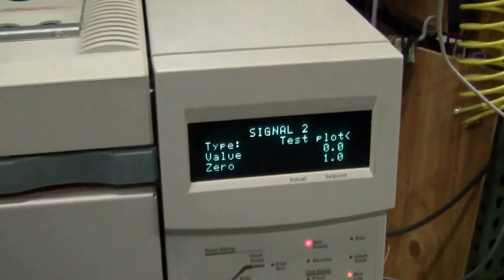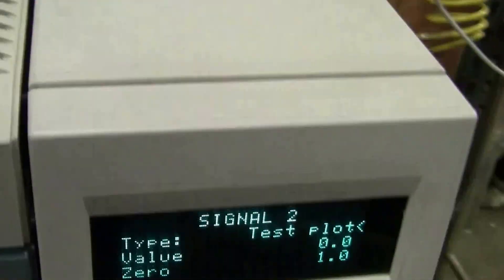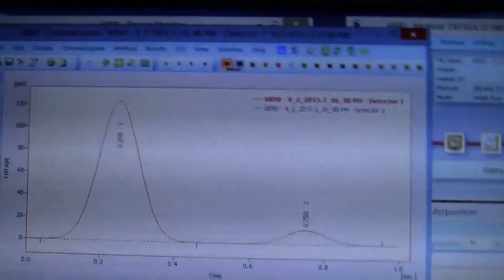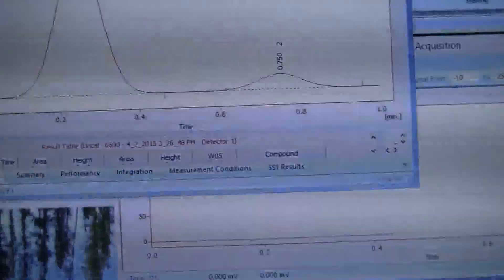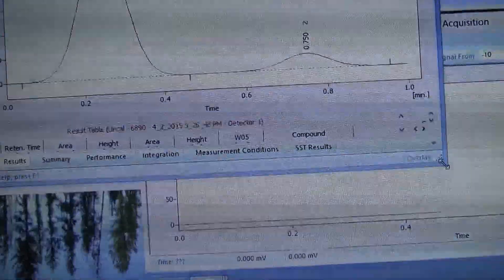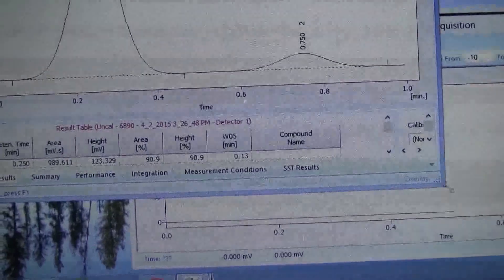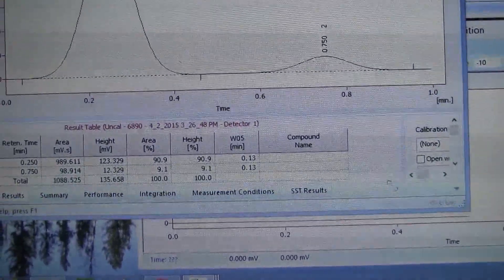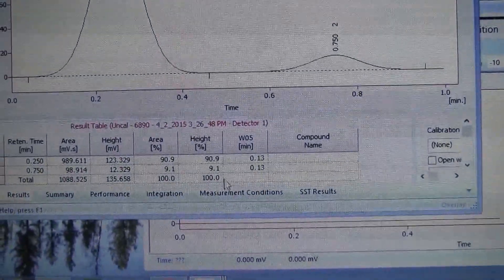We have it set up to do our test plots. You can see right here is an example of one of the test plots where you can see that the peaks are magnitude away from each other.